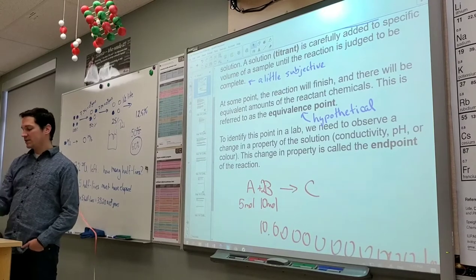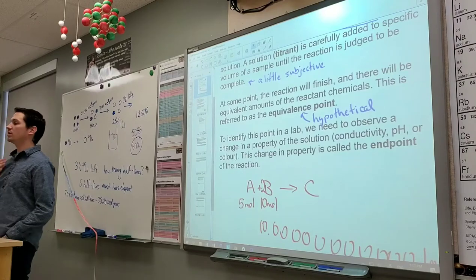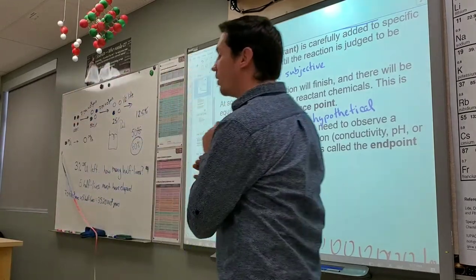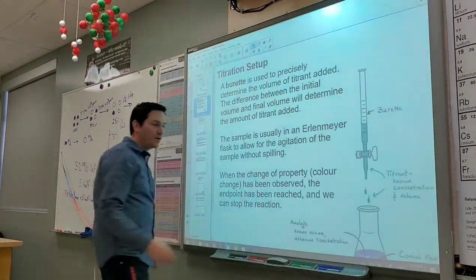Now, there's a lot of nuance in titrations. There's a lot of tiny tips and tricks that I'm going to try and tell you over the next couple days. But first, we want to get really well acquainted with what a titration is. So if you just flip over the page.